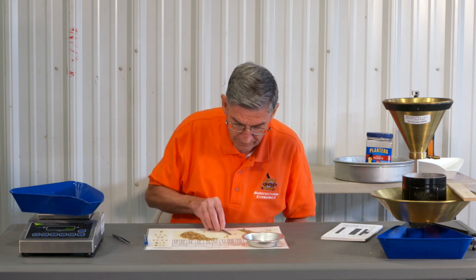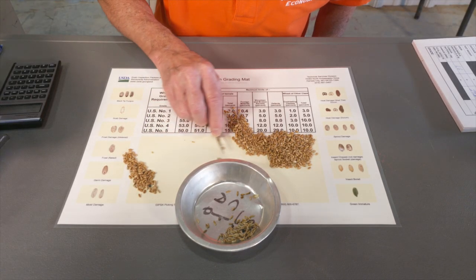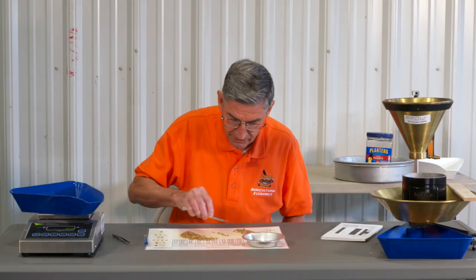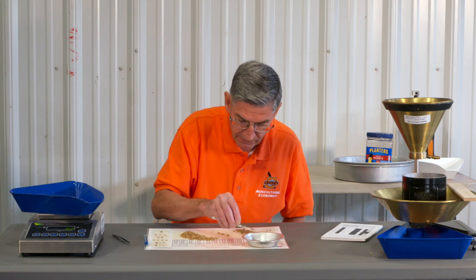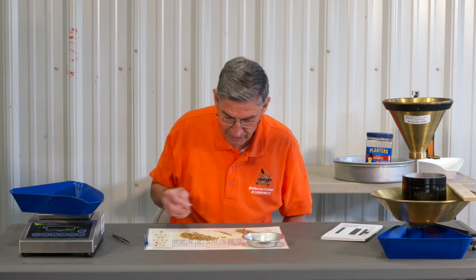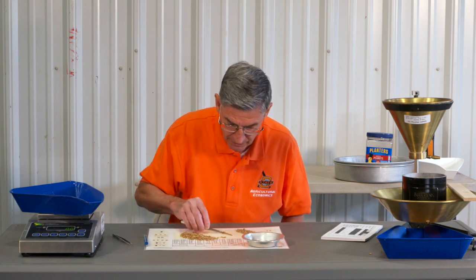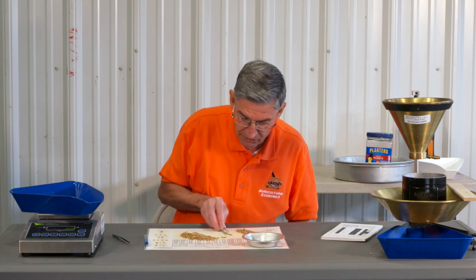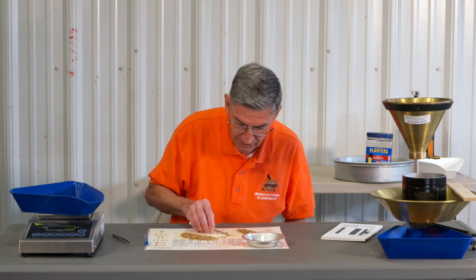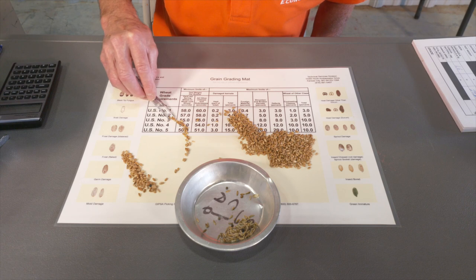Lining them up, moving them over, spotting that rye, getting another line going — that one's clean. After you've done this a while you can just go down through and spot the rye and non-wheat materials as you put them out in these lines. I like to keep them about one kernel thick across here. This sample seems to have a lot of rye. Rye is about the same size as wheat, making it difficult to spot if you're just working around in a pile.